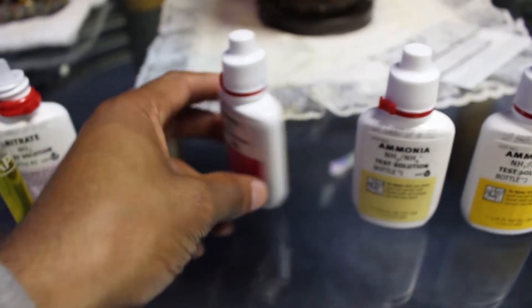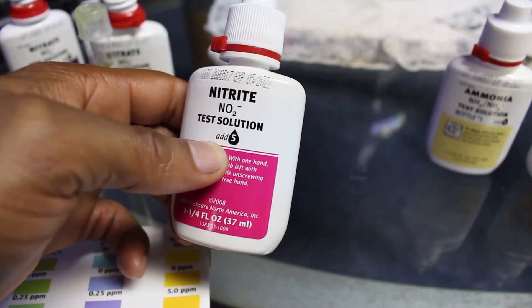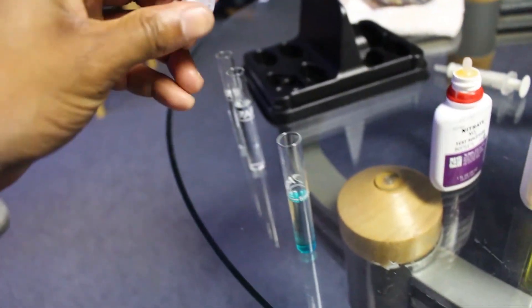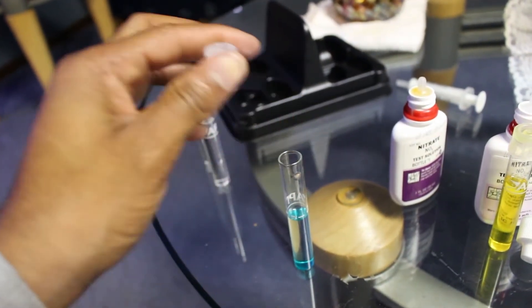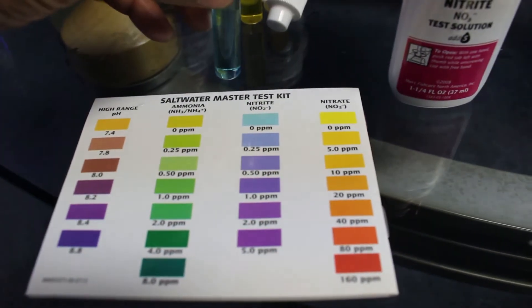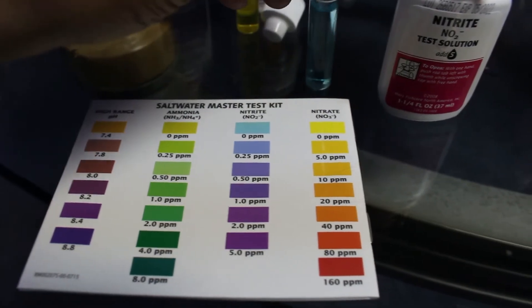Now I'm going to do the same thing with the nitrite, but this one is different — it says add five drops. So five drops of the nitrite solution. Get the cap on and shake it. Go back to your color chart reading and match the color you have. Mine is zero — so the nitrite test is done.